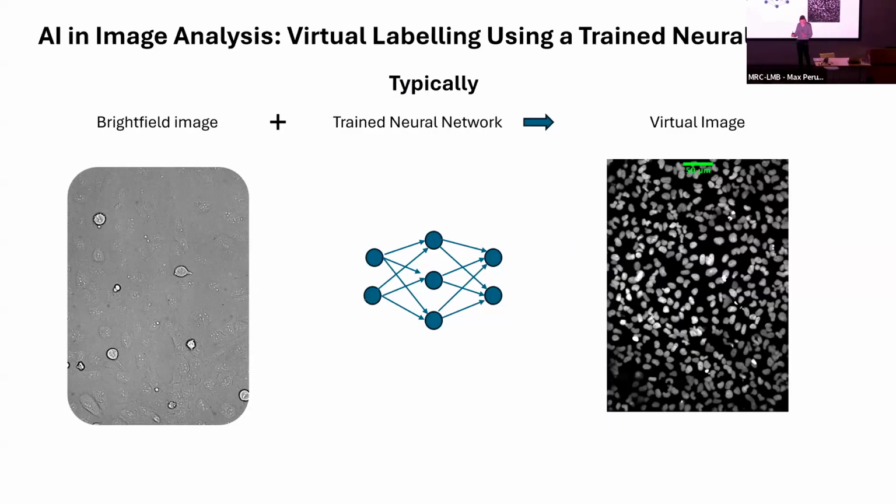One of the big problems we have is the more imaging we do, the more likely we are to kill the sample if we're doing live imaging. Bright field is very gentle on the sample, so you can do that at will. So that gets us past it. DAPI in particular, like every other nuclear binder, eventually is toxic. You've got DNA with molecules stuck all over it. It interferes with cell division, and these cells will eventually die because of it. So you can get around that by doing this.